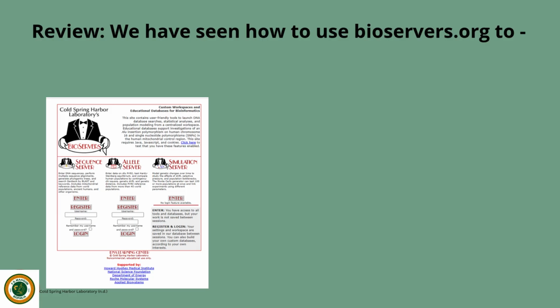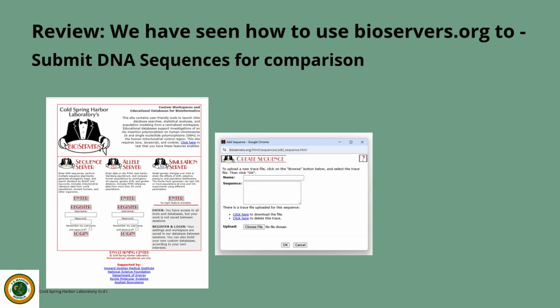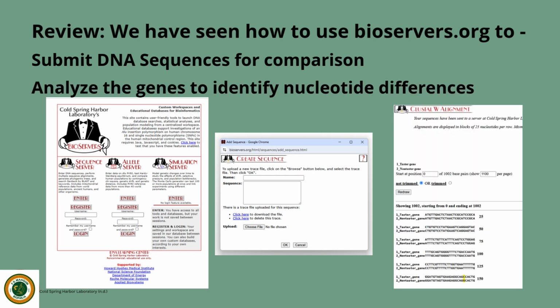So in this video, we saw how to submit DNA sequences into the bioserver sequence server, and then analyze the two sequences side by side to identify nucleotide differences. In the next part of this lab, we will add more sequences and investigate other aspects of the taster gene.